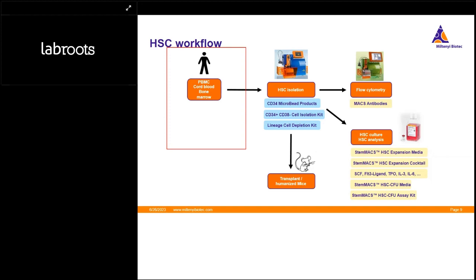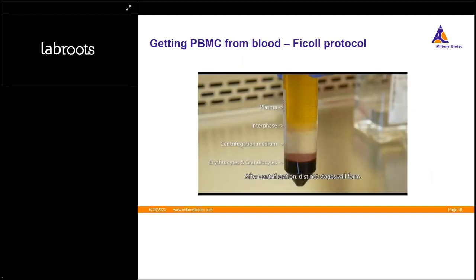A very typical, standard way to do this is this. If you work with a lot of blood samples, you likely know what this is the second you see this image. This is a Ficoll density gradient cell separation, running the Ficoll buffer.